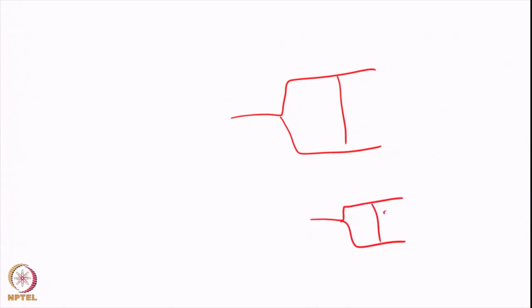If you do that, the polarization from H nuclei can be increased, and that is called spin locking or the Hartmann-Hahn matching condition. Let us see what we actually have to do. This Hartmann-Hahn matching condition is the crux of solid state NMR. Here, say, is the proton signal, and this is for carbon, for 13C, and this is for proton.